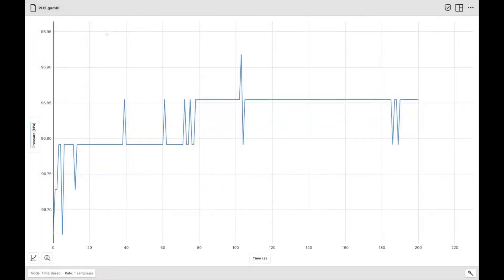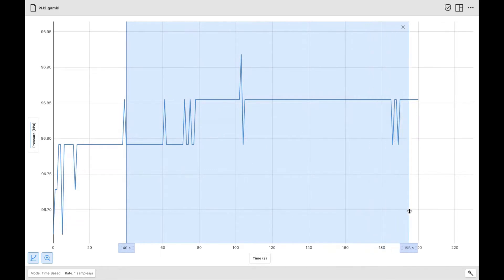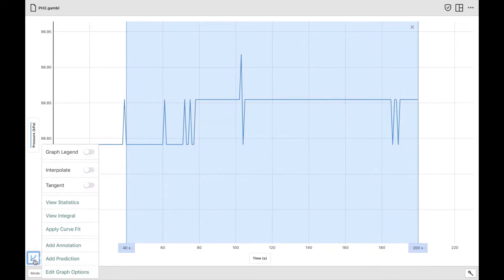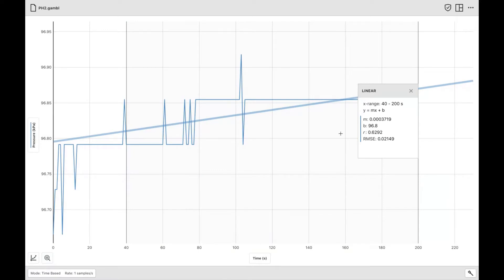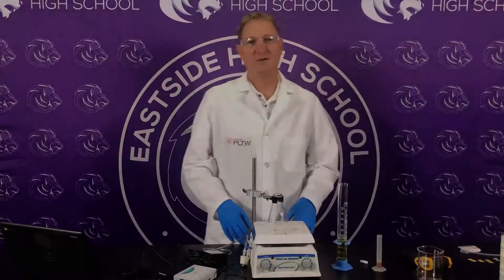If you're watching this portion of the video, you chose pH as your experimental group. We're going to compare the pH at a lower end and a higher end. These are your results for pH 2. Select the data from 40 seconds to 200, choose the graphing tool, apply the fit curve — it defaults to linear, hit apply. The data we're looking for is M, which is the slope of the line. This lets us compare pH 2, the baseline pH, and pH 11 to see which had a faster rate of reaction.